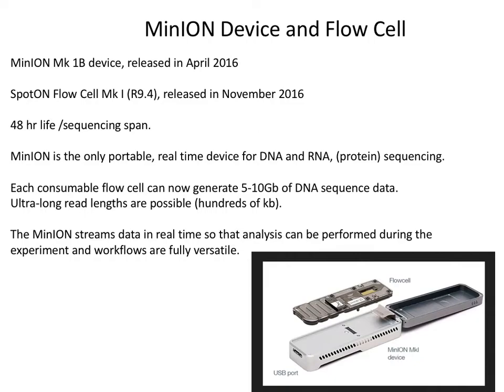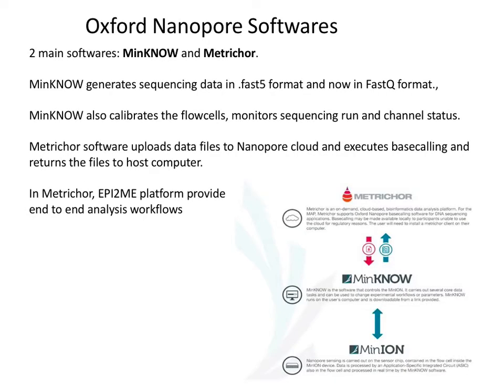And it's still quite expensive, because of all the electronics on the flow cells that they sell you. But they're trying to deal with that, where they would have a carrier for the flow cell with the electronics, and the nanopore bits you can just throw away. That will cost you a few dollars. So that's coming. SmidgION, they talk about it, will come in the future.